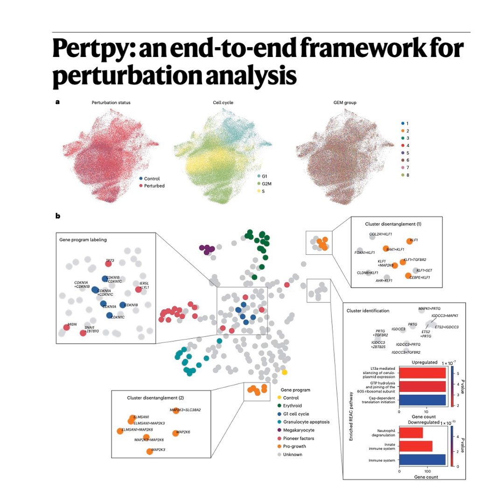Good idea. So first, Pertpy gives you a structured pipeline that starts with robust gRNA assignment to link the perturbation to the cell. And critically, our first key takeaway is that it offers two models for this. A simple threshold for clean data and a more advanced mixture model for noisy or complex high MOI screens. Then, it leverages the whole scverse ecosystem to handle technical artifacts like batch effects. And then, takeaway number 2, it enriches that raw data with crucial biological context from external databases like DepMap, CMAP, and PubChem. And our third key takeaway is that it performs essential quality control with Mixscape, which computationally identifies and separates the truly perturbed cells from the escapees, ensuring your analysis is based on a clean signal.